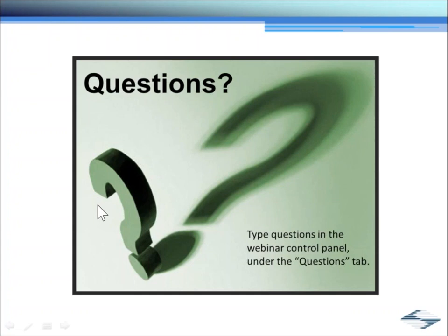So I guess what I would say is that the optical axis of the MOM is running horizontally from front to back. So the primary scanner location is on the back of the microscope on the right, and then it enters the scan lens and tube lens along a vertical path. So that's the actual location, and then a periscope brings the laser up off the table into those mirrors.